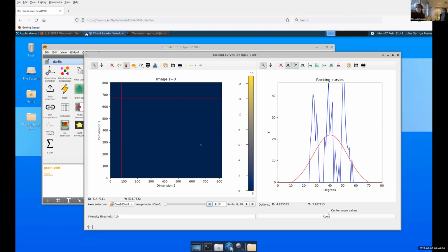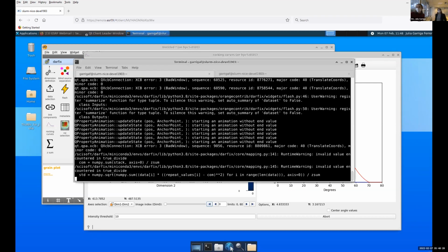So we just feed the data, and we look here at how it processes. For example, now it says it's 5 minutes, so it's still a lot, even though we applied a region of interest. So we will leave it computing, maybe in 3 minutes and a half we have it. That's why it's important to have multiple cores. When we allocated memory, I asked Gabriel to give us 5 CPUs per person, because if you have more CPUs, this process goes faster because it's in parallel.